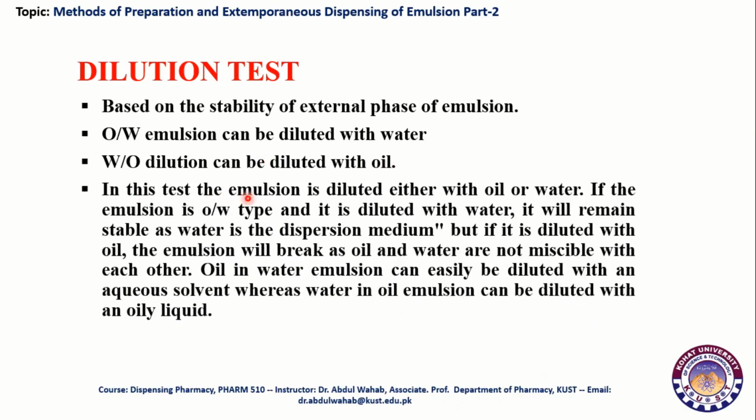In this test, the emulsion is diluted either with oil or water. If the emulsion is oil in water type and it is diluted with water, it will remain stable, as water is the dispersion medium.